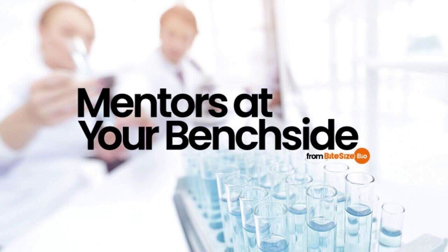One way to do this is global thresholding, where you subtract a threshold value from each pixel so that every level below the selected cutoff will be background, while every pixel above will fall into the region of interest. While this is intuitive, global thresholding is crude and may lead to unwanted situations like excluding low-value pixels that are close to the background but are in fact positive and real data.